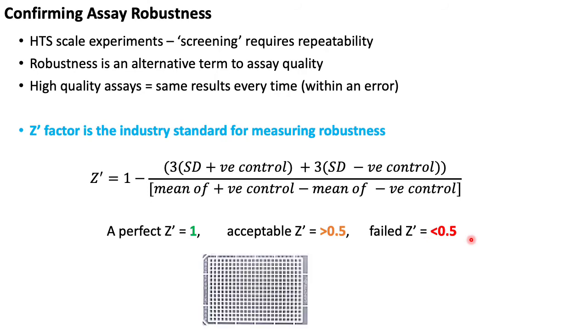So when we lay out the plate, we're looking at the positive and negative controls. Essentially we have 4 sectors in the plate. Here we've got our positive control, so this is where we'll add our positive control, and in the other sectors we'll add our negative control. And we'll also make 3 replicates of this same plate, okay? So we don't just rely on one plate, we need to make multiple replicates, at least 3 replicates.